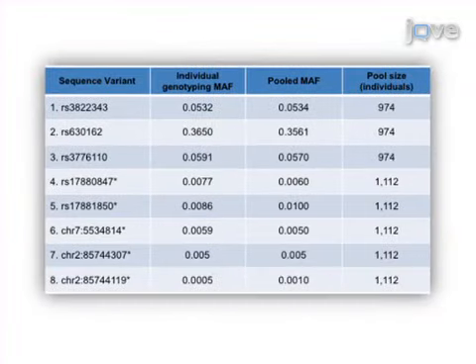Ultimately, SPLINTER analysis of pooled next-generation sequencing is used to show genes within populations harboring a preponderance of rare, functional variants. Demonstrating the procedure today will be Francesco Vallania, who's a graduate student in the lab of my mentor and our collaborator Rob Mitra, and he'll be joined by Enrique Ramos, a graduate student in my laboratory.